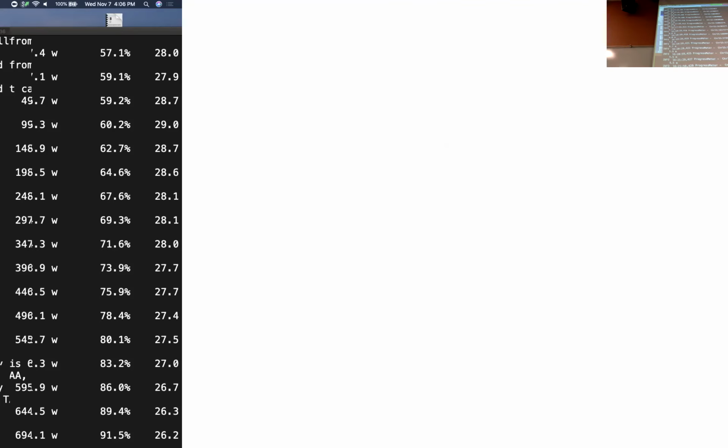So what we've done with the R script is basically create a loop that goes in and says, look at this genotype, go look at the corresponding read depth. If it's less than 6, turn it to missing, right? So do it iteratively. And then at the end of the day, after doing all that, you can go back and say, I only want a missingness of no more than 20%. If I have a SNP that's more than 20%, get rid of it and keep the rest, right?